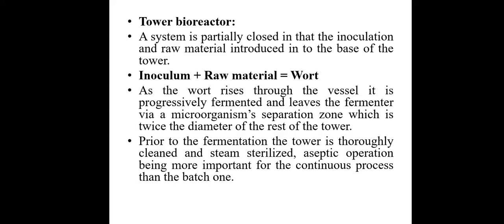Today we are going to discuss another type of bioreactor, which is known as the tower bioreactor. The tower bioreactor looks like a tower, so it is named the tower bioreactor due to its construction. The system is partially closed.